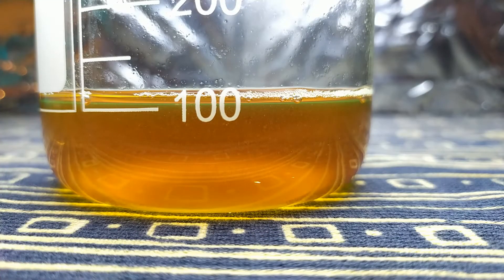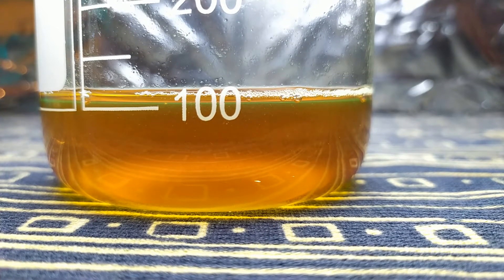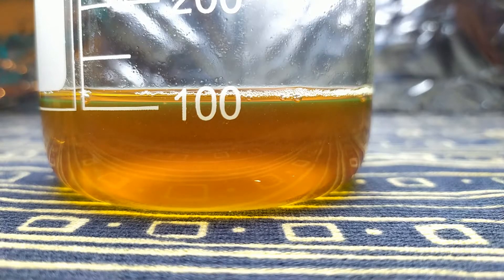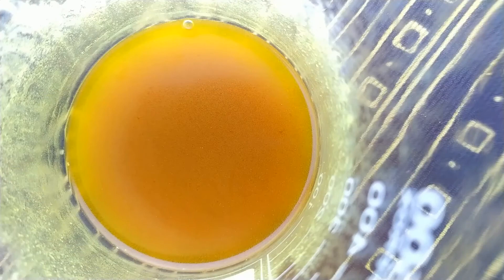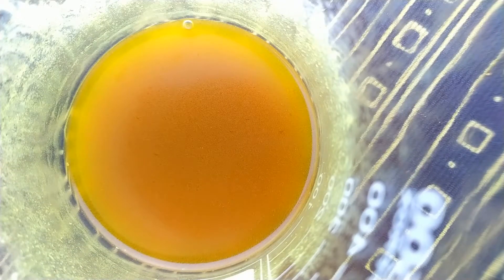The key to successful recrystallization is saturation of your solution. As you can see, I added too much water and almost no crystals precipitated out. If you face the same issue it is not a problem — we just need to reduce the total mass of our solution. The easiest way is to boil it down.